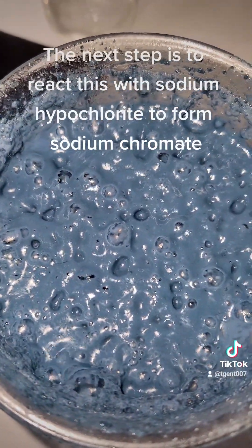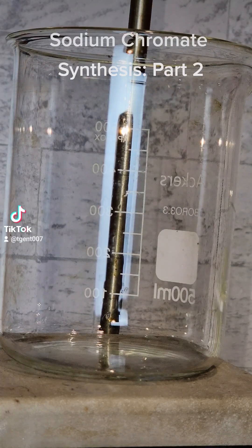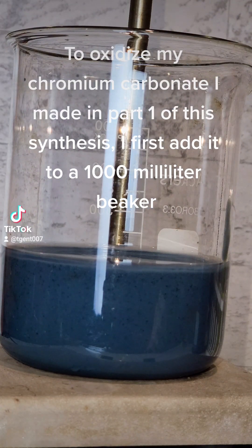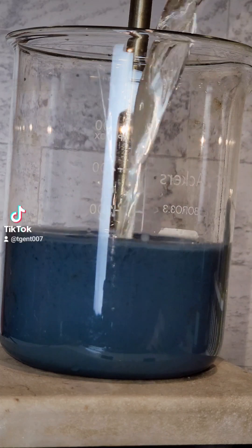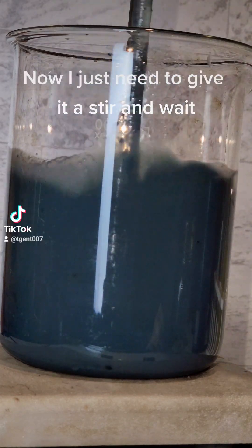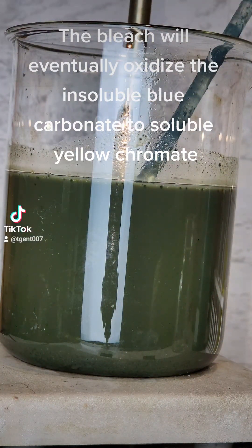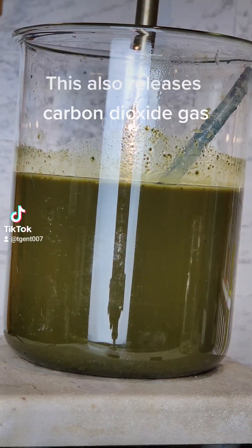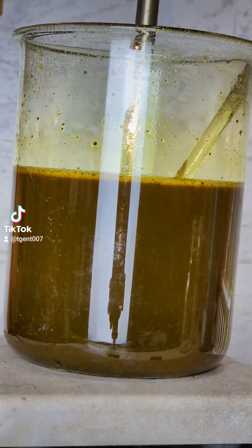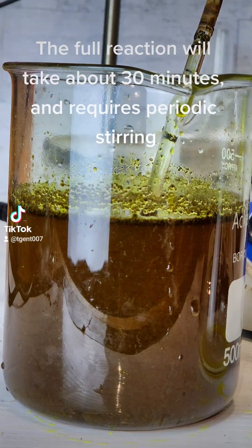The next step is to react this with sodium hypochlorite to form sodium chromate. To oxidize my chromium carbonate made in part one, I first add it to a 1000 milliliter beaker, then add 200 milliliters of sodium hypochlorite bleach. The bleach will eventually oxidize the insoluble blue carbonate to soluble yellow chromate, releasing carbon dioxide gas. The full reaction will take about 30 minutes and requires periodic stirring.